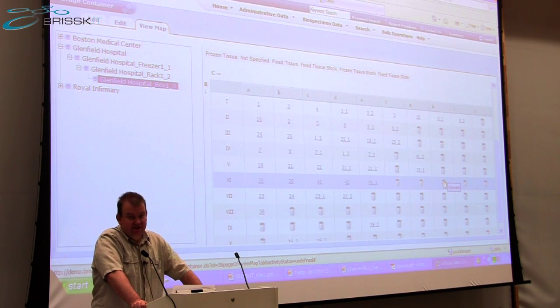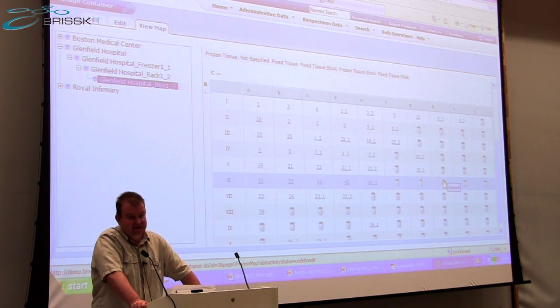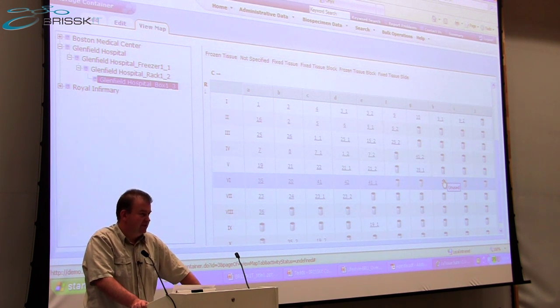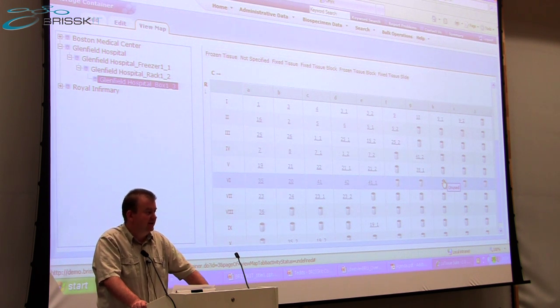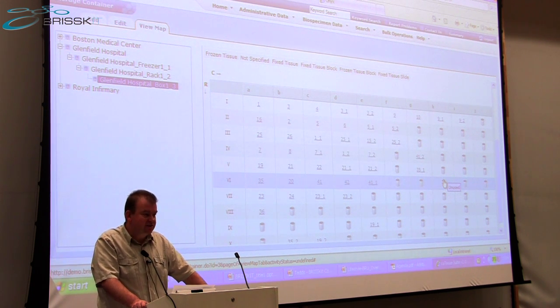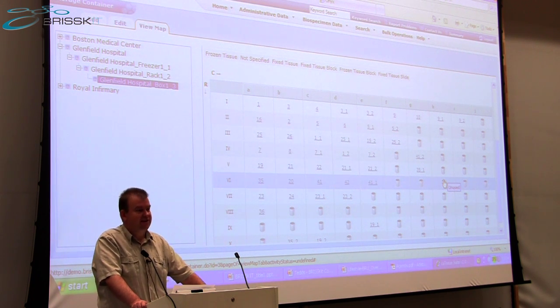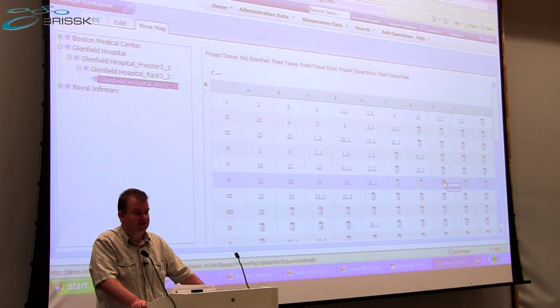So the CA Tissue data, we've seen the transfer of data from Civi into CA Tissue. What we're not going to show you, because it's configured to happen on a nightly basis and we don't want to sit here till tomorrow morning, is that all of the data held in CA Tissue is refreshed into I2B2 within your individual BRISSKit installation on a nightly basis. So the stub record in I2B2 is triggered by Civi, and then on a nightly basis, CA Tissue passes to I2B2 all of the data held in CA Tissue about samples relating to each of the participants.